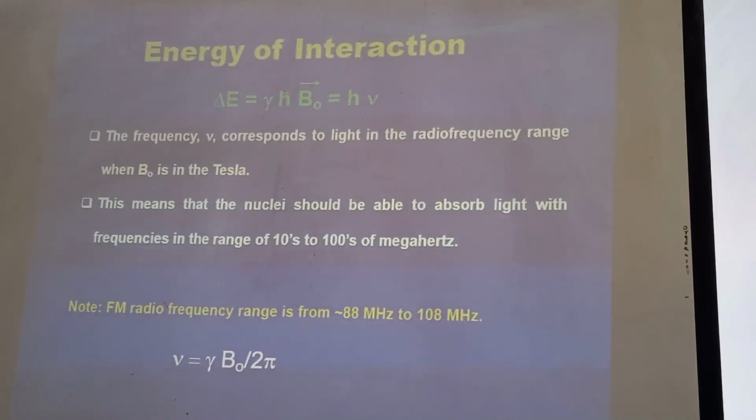Why do they have different Larmor frequencies? Because each of them has a different gyromagnetic ratio. Each of them has a different response towards the magnet. So NMR is a big expensive radio and it operates on the same principle but in a reverse direction to your radio set.